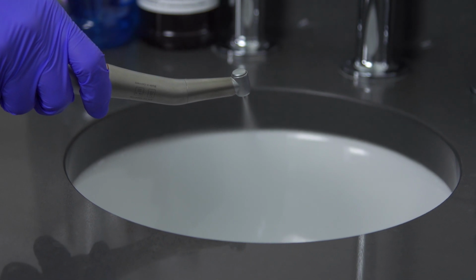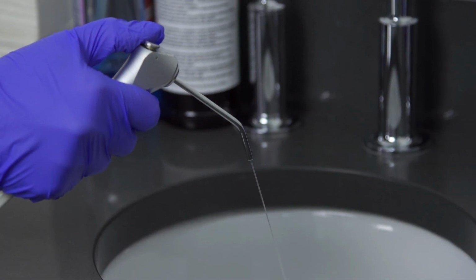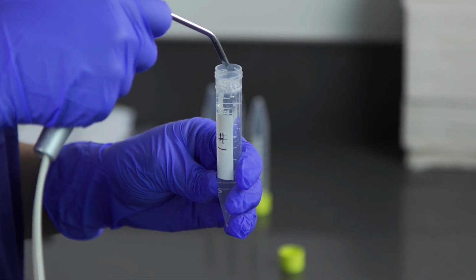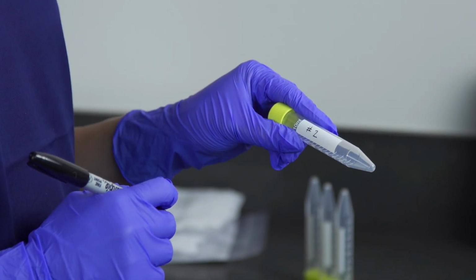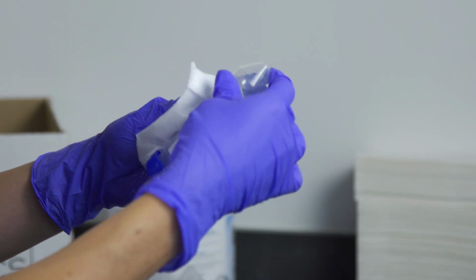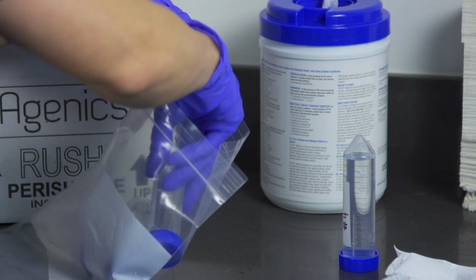Run water from each source to be tested for a minimum of 10 seconds before filling the sample vial. Fill the vial completely to ensure adequate sample volume and seal tightly. Using a black permanent marker, mark each vial with the sample number corresponding to the chain of custody sheet. Secure the lid on each vial, wipe clean with a disinfectant wipe, and place in the clean sealable bag provided.